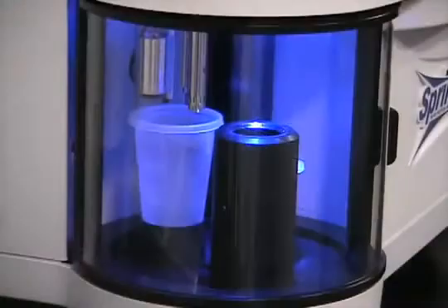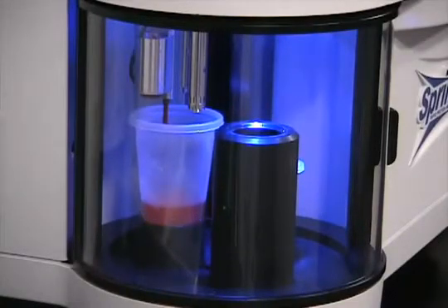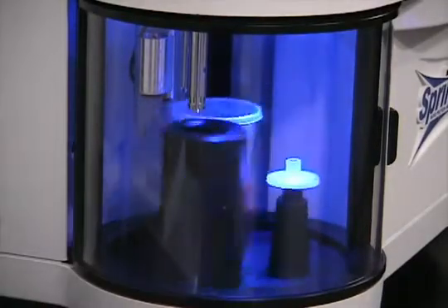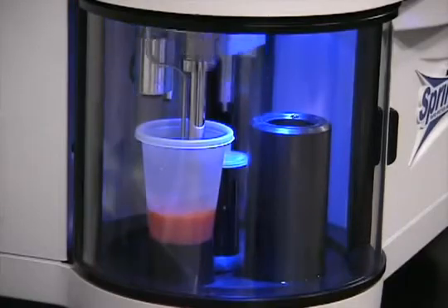Sprint adds a known amount of ITAG to the sample. Then it homogenizes the sample, releasing all proteins to bind with the ITAG, forming an insoluble complex that drops to the bottom of the cup.